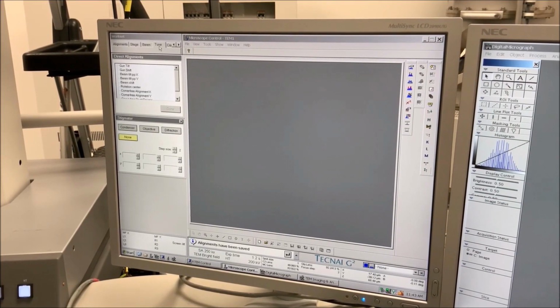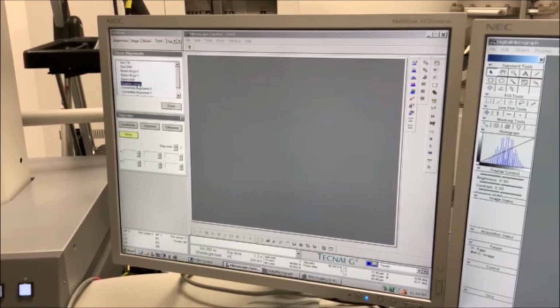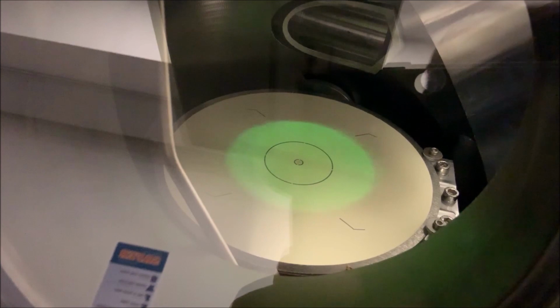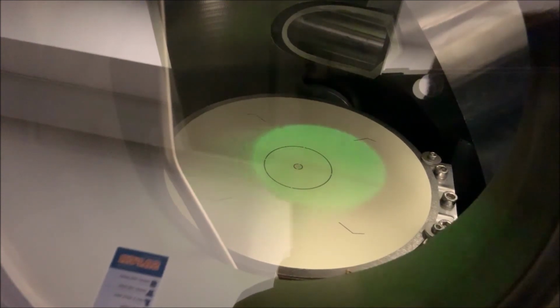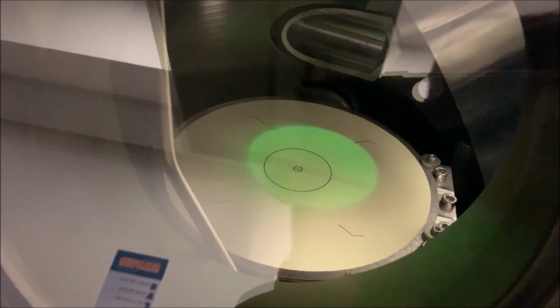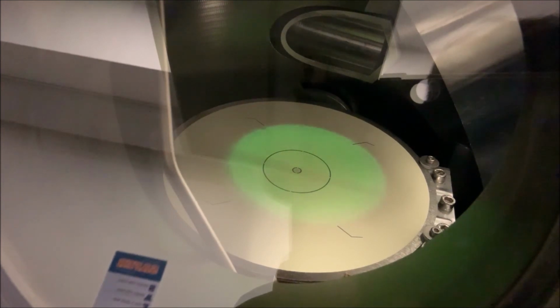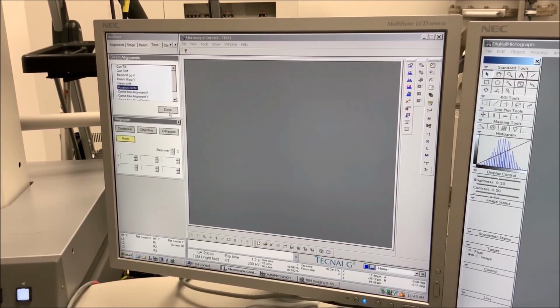To perform rotation centering, navigate to the Tune tab in Microscope Control, then to the Direct Alignments control panel and select Rotation Centering. The strength of the objective lens will begin to oscillate. Use the multifunction knobs on the left and right-hand control panels to minimize shifting of the image as the strength of the objective lens is oscillated. When properly corrected, the image should go in and out of focus but should not shift. When finished, return to the Direct Alignments control panel and select Done.